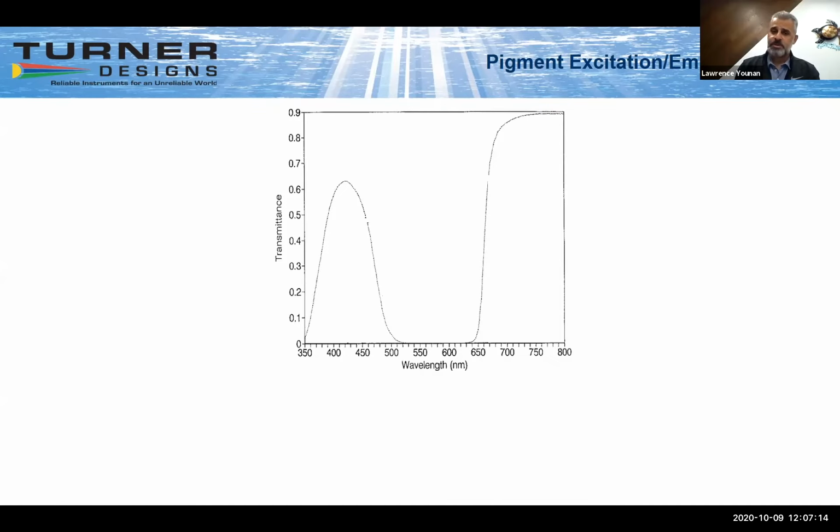So in those older model fluorometers, we used to have these bandpass broadband filters that let in all types of interference from different pigments, chlorophyll for example. We would fit this filter pair that you see on the screen here into those fluorometers for looking at chlorophyll fluorescence. However, you can see that a lot of wavelengths are being detected as well.